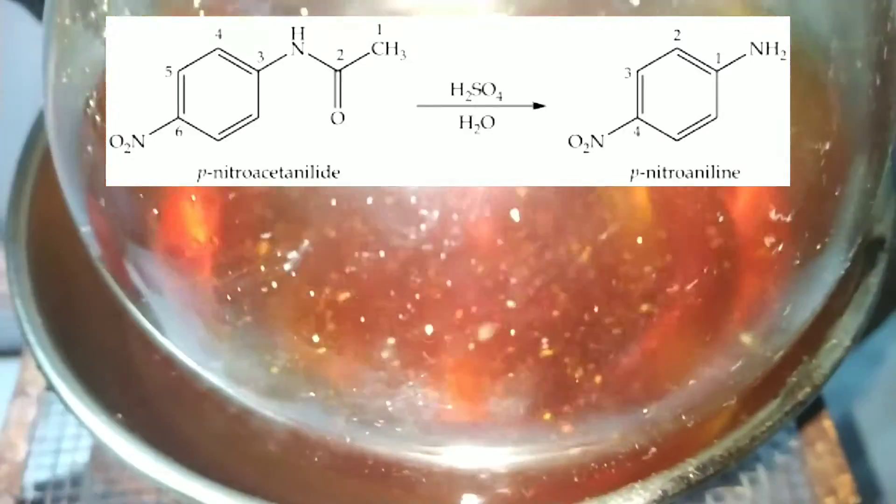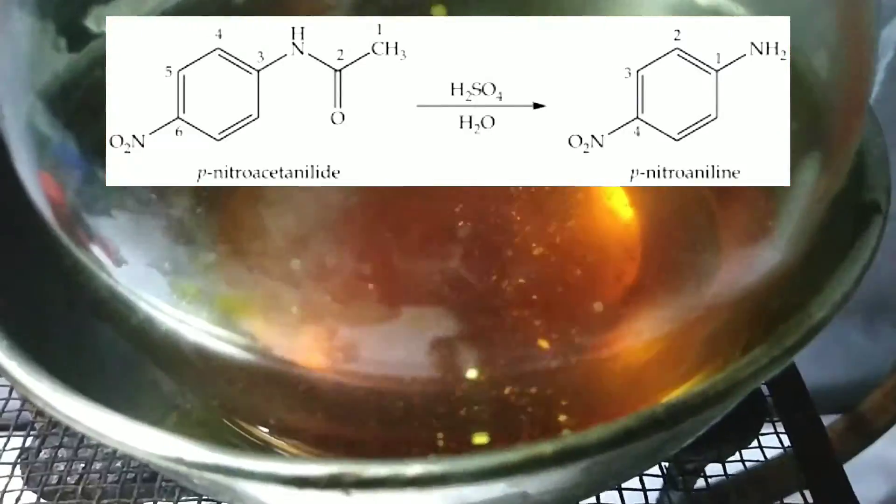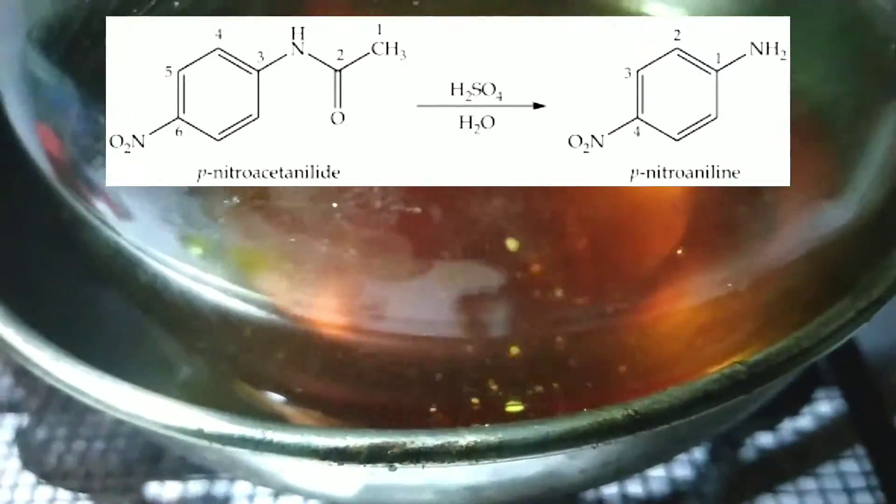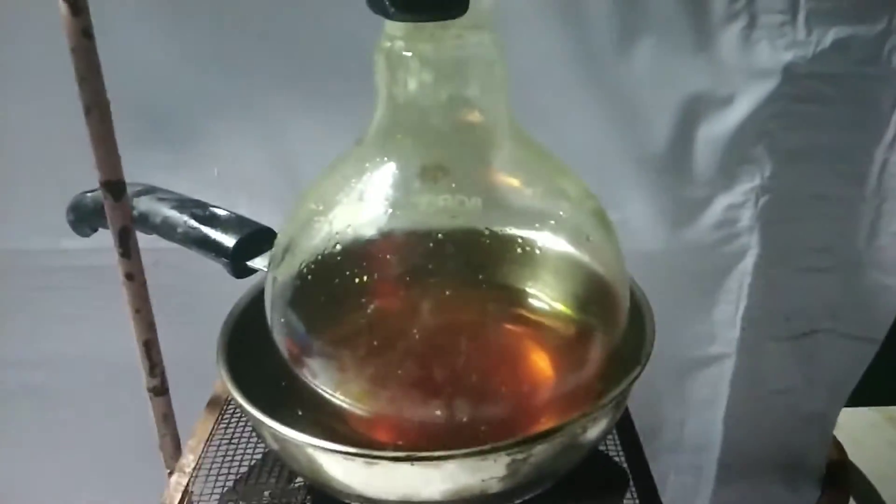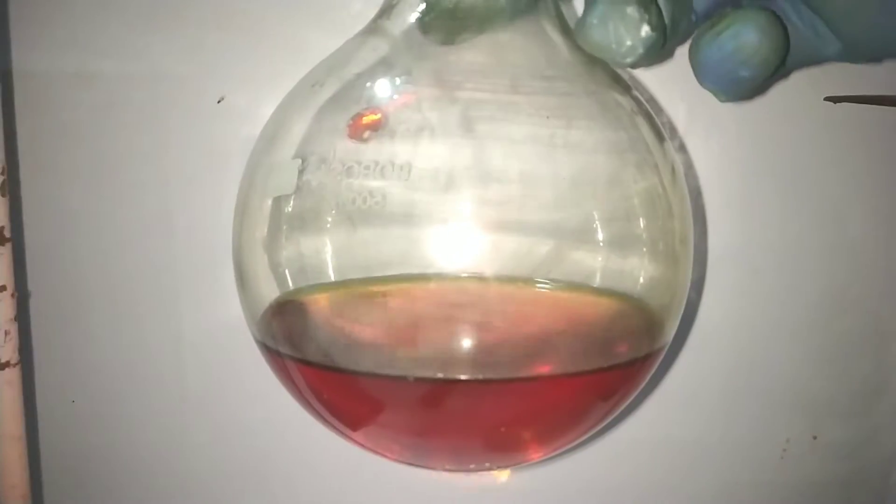The paranitroaniline is now present in the liquid as the sulfate form. After everything gets dissolved, we keep heating the flask for about 2 to 5 more minutes and then remove the flask from the oil bath.